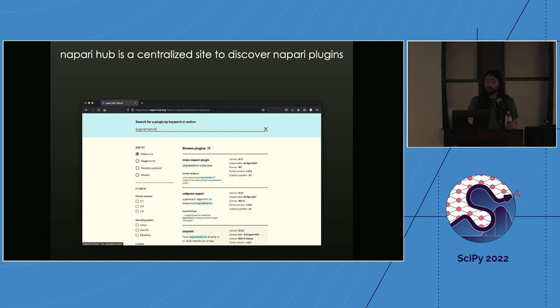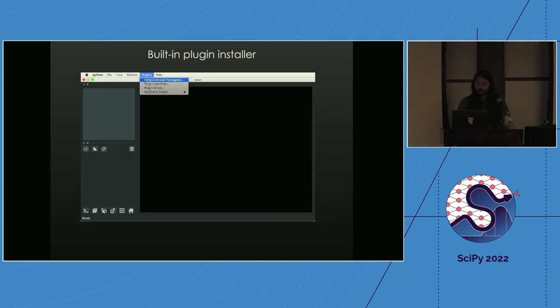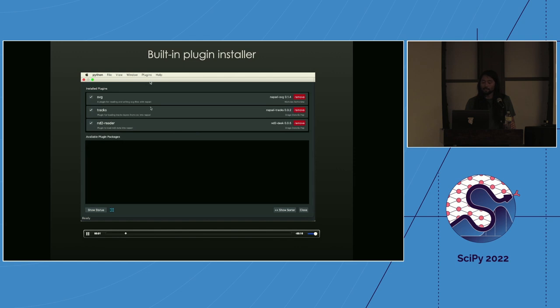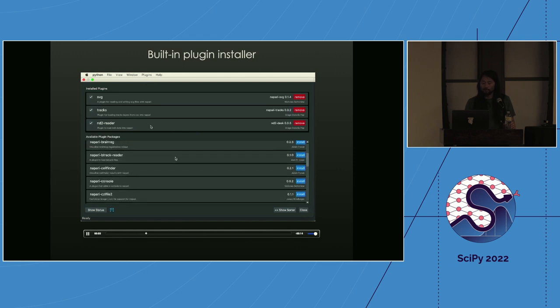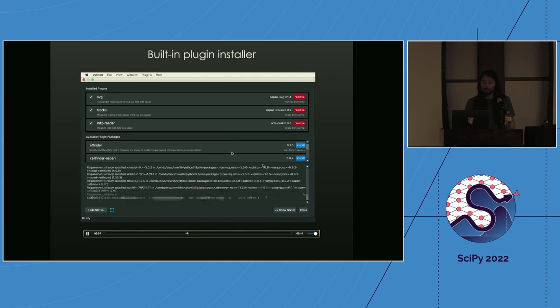I use the Napari Hub both to find plugins to help me do my work, and when I'm thinking of making a new tool — it's always the first place I go to see if somebody has already done this, so I can contribute to their work rather than creating something new. For installing plugins, you can install via the command line, but we also have a built-in plugin installer accessible via the plugin menu.